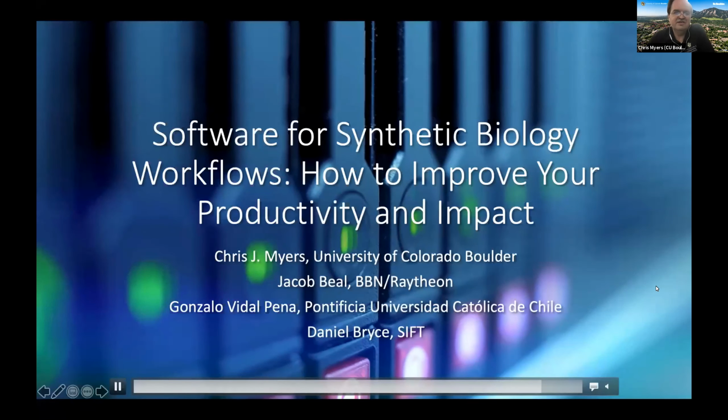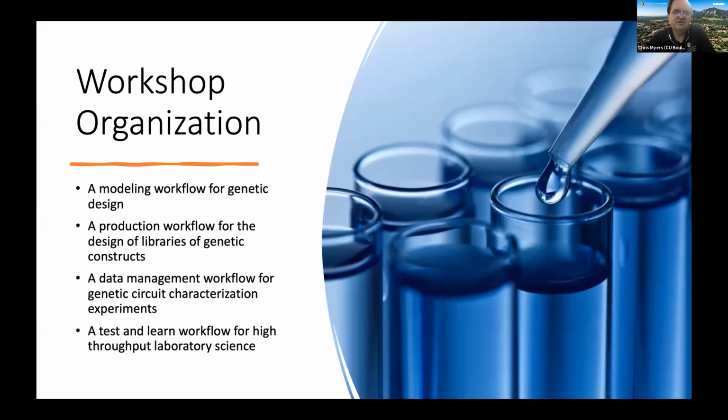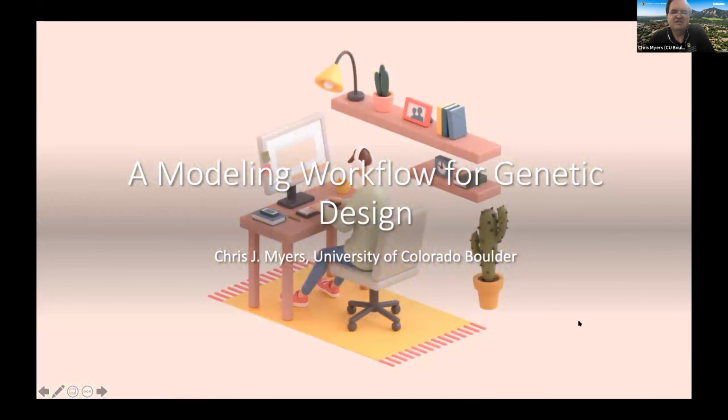So this session is going to be organized into 4 parts. There's going to be a presentation on a modeling workflow for genetic design given by myself, a presentation on a production workflow for the design of libraries of genetic constructs given by Beal, a data management workflow for genetic circuit characterization experiments given by Gonzalo Peña, and a test and learn workflow for high throughput laboratory science, which will be presented by Bryce. So the first presentation, as I said, will be given by myself on a modeling workflow for genetic design.